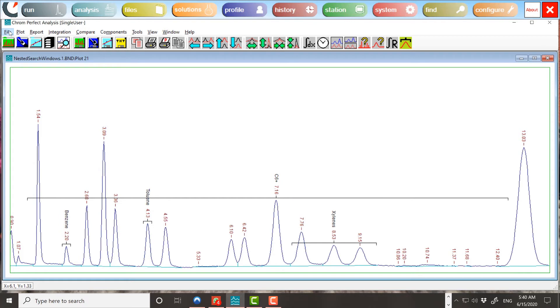The second change affects the window response. When search windows overlap and a peak lies under both windows, the peak will not contribute to both components' window responses as before, but to the window response of only one component. This may be the narrower or the wider window, depending on the settings in the calibration file.